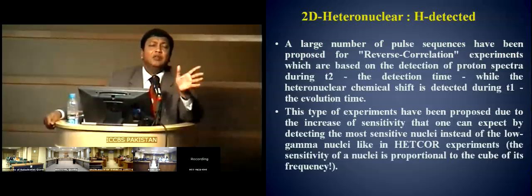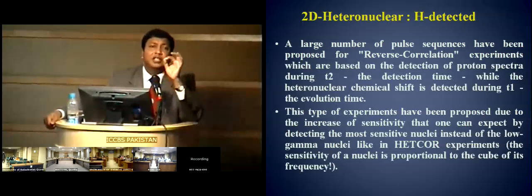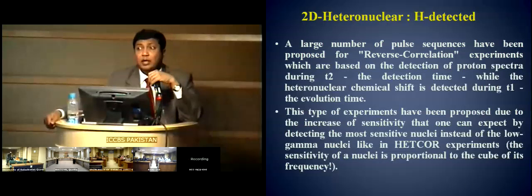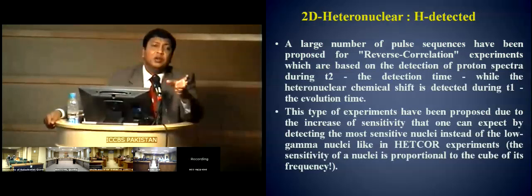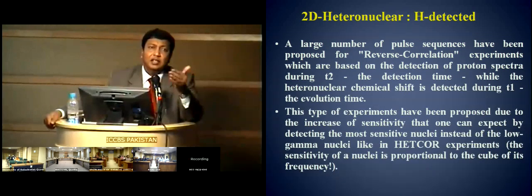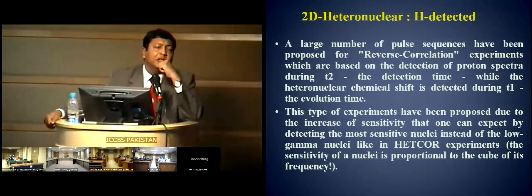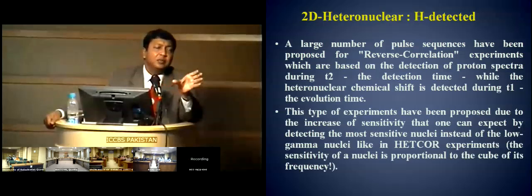Coupling constant, kindly always remember, no spin echo pulse can bring them together. Never. Please always remember that this is the key of understanding lots of NMR. The consequence of a 180 pulse in a homonuclear pulse sequence is spin echo, but the consequence of a 180 pulse in case of a coupling is that they would always keep diverging, going away from each other. Okay? So mixing time is a time in which you mix the spins together in a particular pulse sequence.